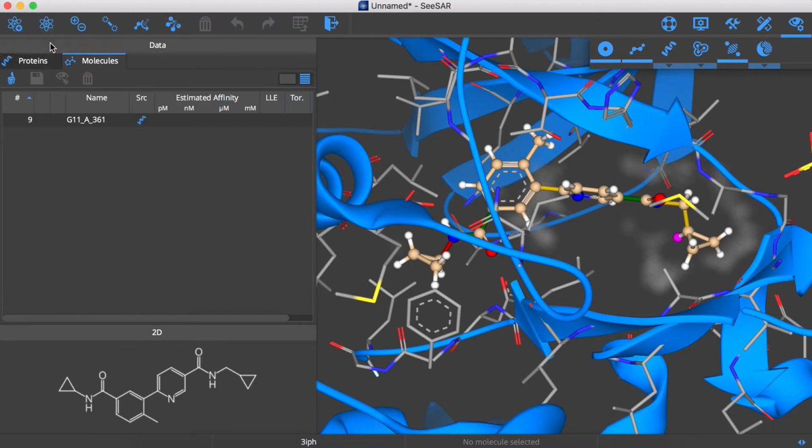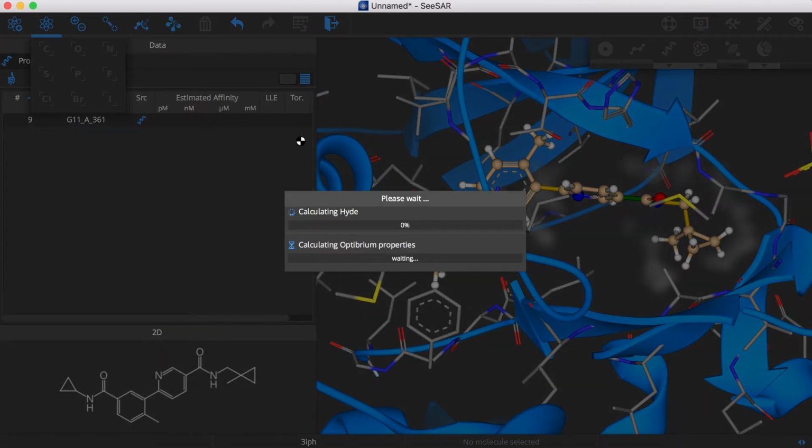The editor is open above the molecular table, and we can change this H into a carbon and see directly the influence that this has on the affinity.